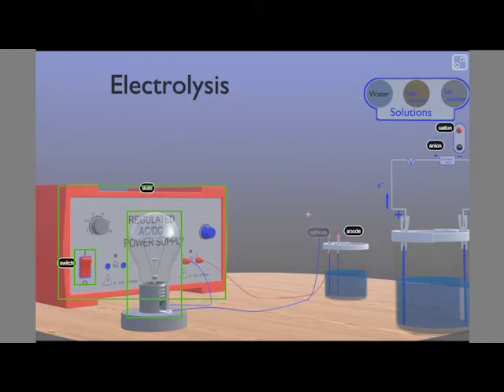On this side, we also have a container which contains the solution to be used in the electrolysis, and two electrodes - you can see them here, the blue rods. One is the cathode and the other one is the anode. This will be discussed later in this video.